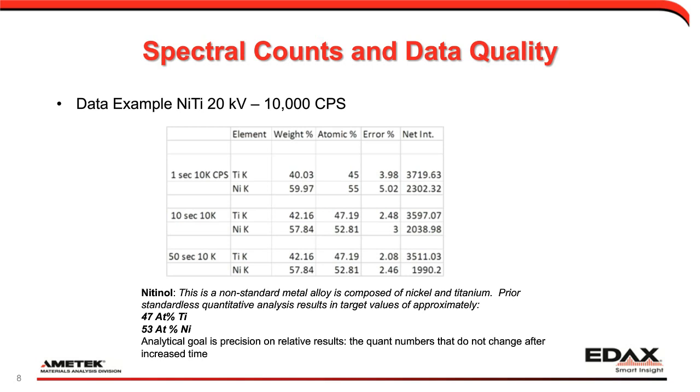Now, this is also chosen as an example because it represents a relatively easy set of elements. The titanium and the nickel represent mid to high X-ray energies, and there are no overlaps. They're all major concentrations, no minor concentrations. So this is the first easier example.